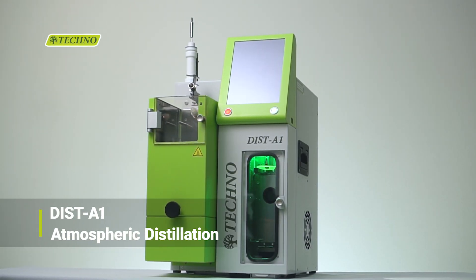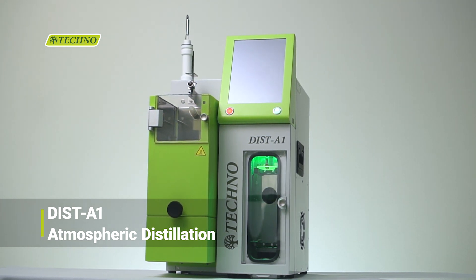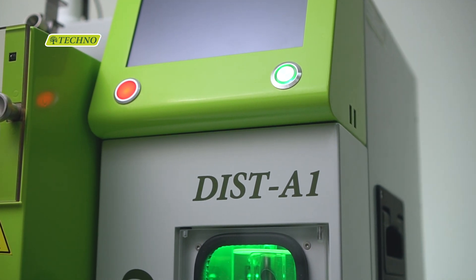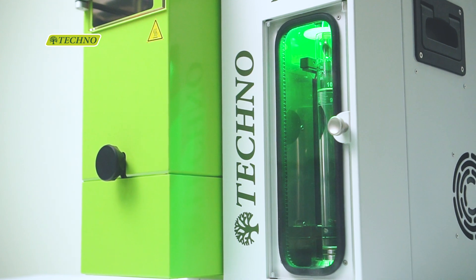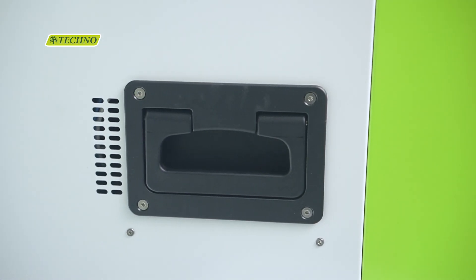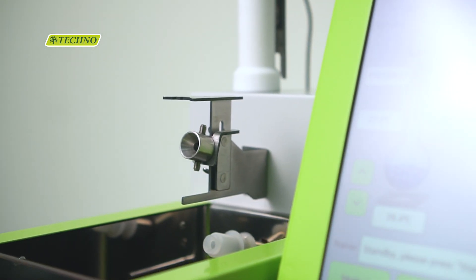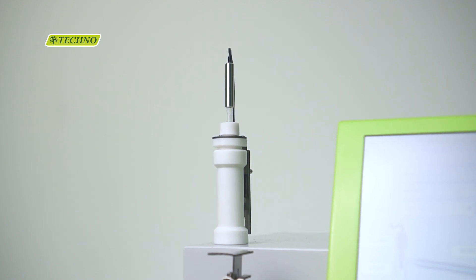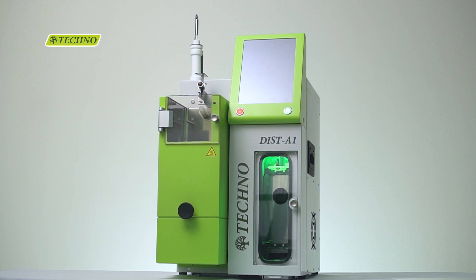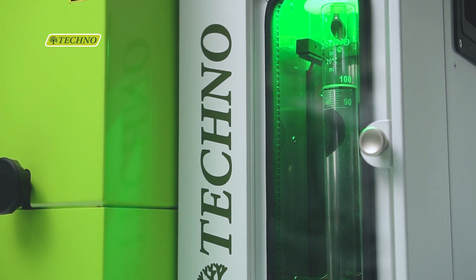The DIST-A1 is an efficient atmospheric pressure distillation analyzer designed with safety in mind. The integrated liquid-free and maintenance-free compressor cooling system closely simulates a water bath used in a manual analyzer and efficiently maintains the required temperature in both the condenser and the receiving chamber.